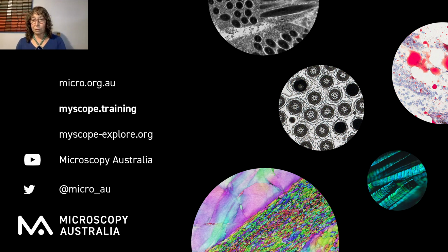Okay, what else have we got here? Is there an EELS module? No, there isn't an EELS module as yet. We're always reviewing what we put into MyScope, and we do have some new modules under consideration. EELS could be extended in with the EDS perhaps, to make a more expansive microanalysis module, but that's not there at the moment.